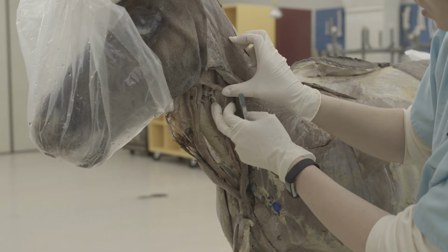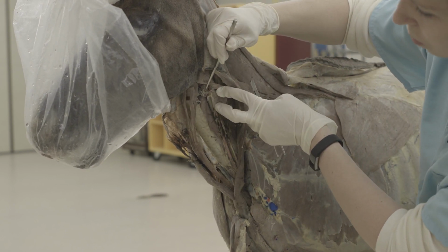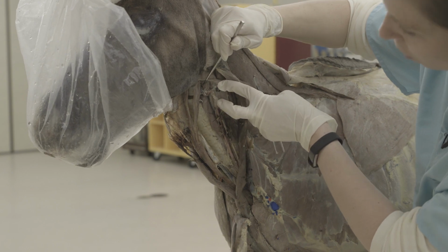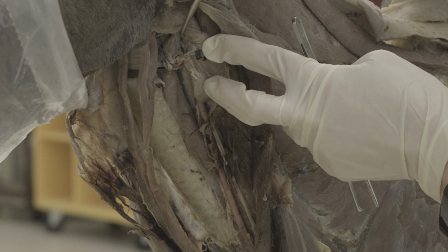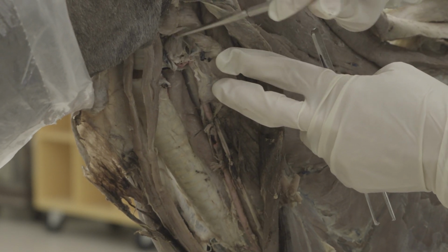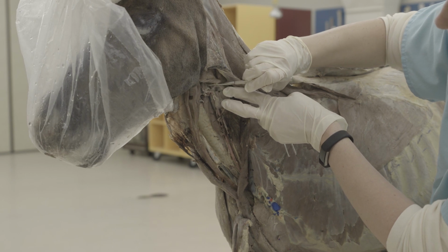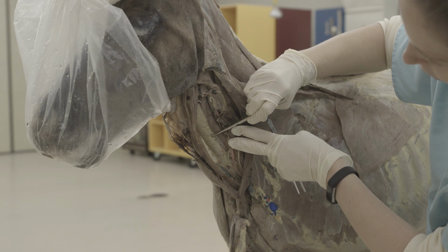Also along the trachea, sometimes you can find them, sometimes you can't, but they're called deep cervical lymph nodes. So right here you can see some little lymph nodes. So those would be cranial deep cervical lymph nodes, and those are actually pretty nice. They're usually very small, and I don't find a lot of them. So those are nice ones there. And I found a couple little guys right along the trachea.